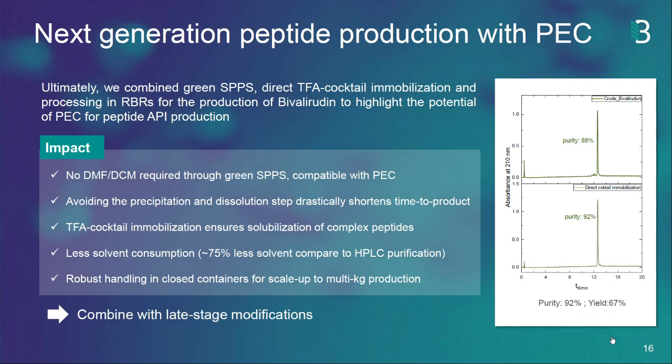Okay. Then some further questions. What is the selectivity with the lysine during the reaction with the aldehyde functionalized beads? Maybe I missed it, but how many equivalents of amino acids were used during the SPPS with this green synthesis? And what would be heating by adding pyridine in TFA in large scale?